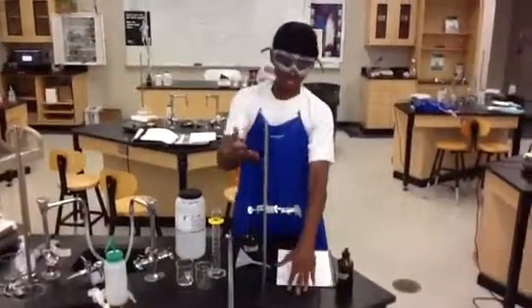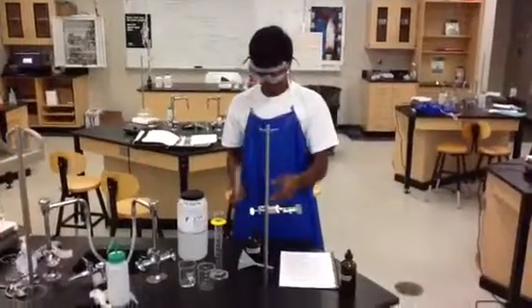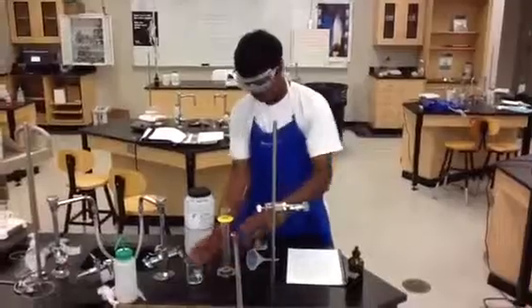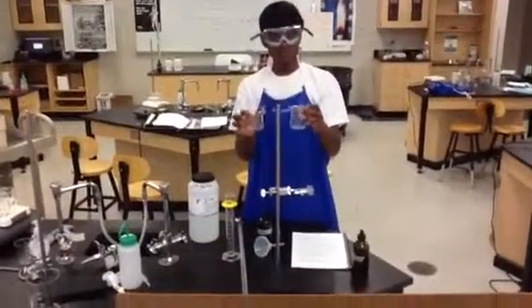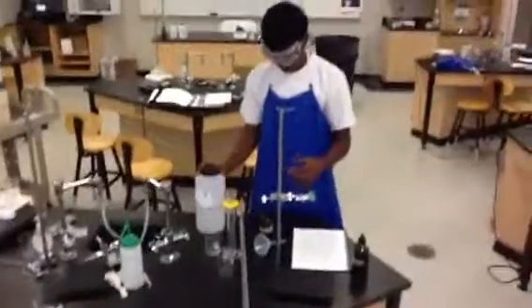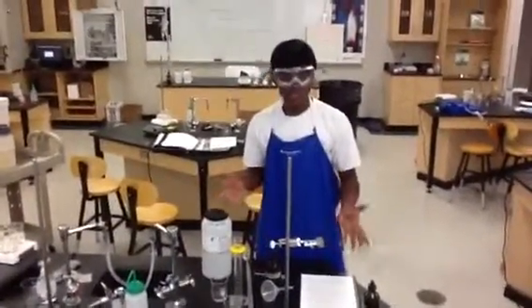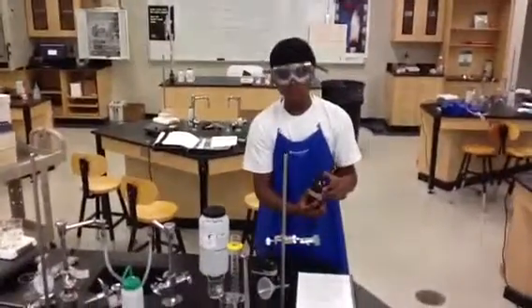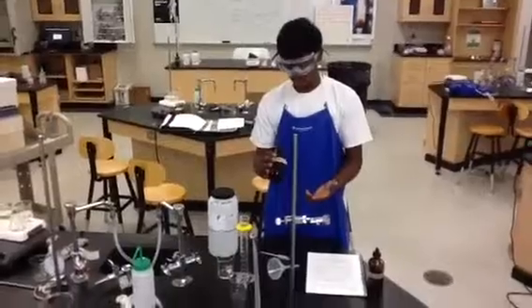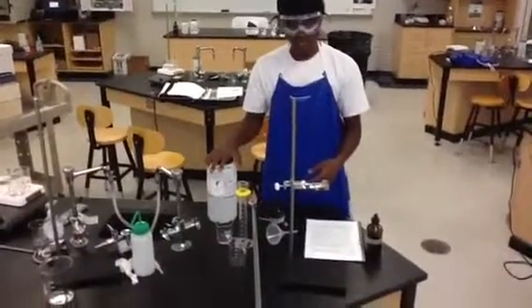There's the ring stand, the clamp, the burette, the funnel, two 150 milliliter beakers, and a pipette. So now let's go over some of the solutions that we're going to be using. There is phenolphthalein, an unknown concentration of HCl, and NaOH.